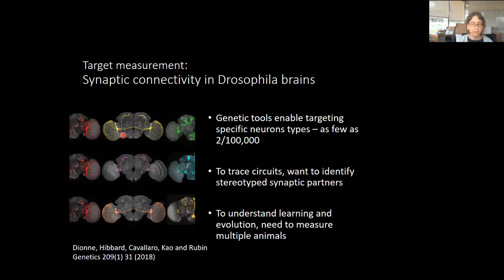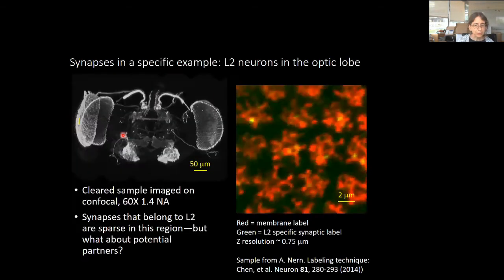So the whole point of this microscope was to image these very selectively labeled tissue samples at very high resolution, so that we could determine if there are synaptic connections between those cells. Here's an example of what that looks like in real life.